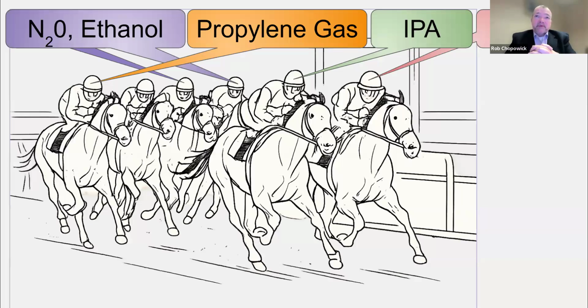As we were doing this testing, we learned that there was a story from when they were doing all this research on what kind of alternative gas and what might be a good detector. In the laboratory where some of this research was going, they were evaporating ethanol, among other gases. And like all labs, there's a lot of IPA kicking around, and they do a lot of cleaning. They try to make sure everything's cleaned in between so you get a good clean environment for your next test.